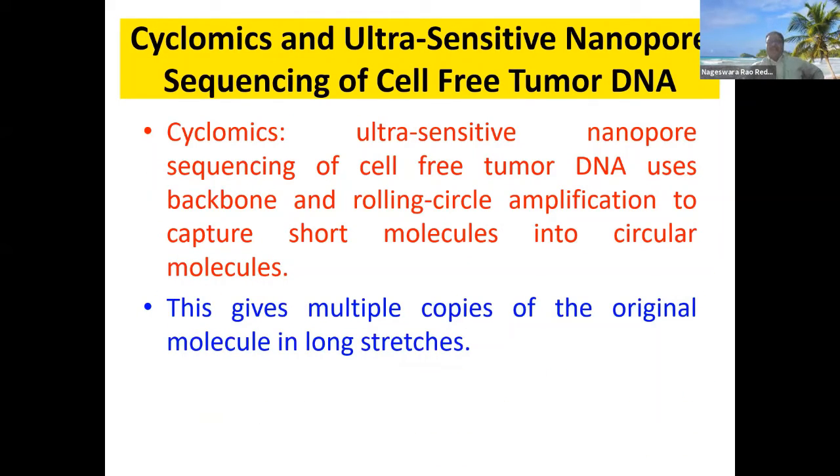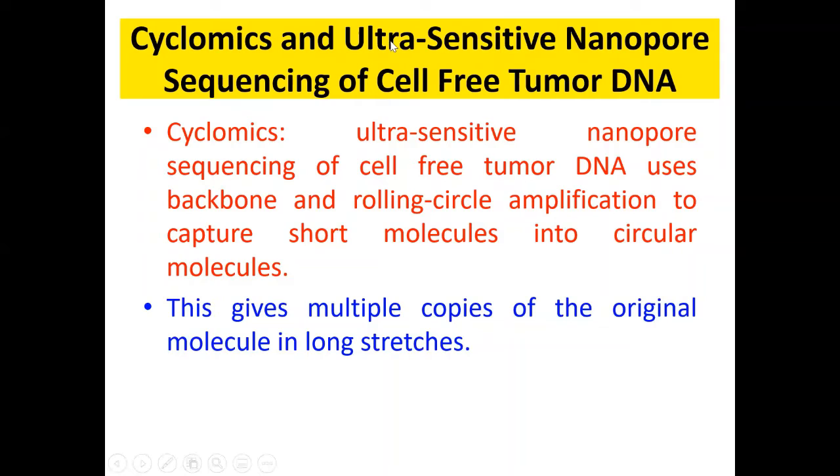Okay, that is ultra sensitive nanopore sequencing of cell-free tumor DNA. Cell-free tumor DNA. So what is this here? How many of you have heard about cell-free tumor DNA? No, sir. We didn't come across it.